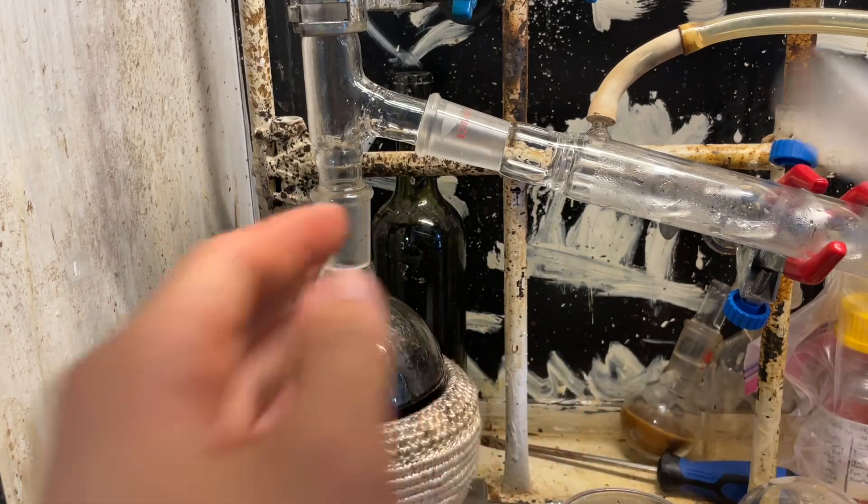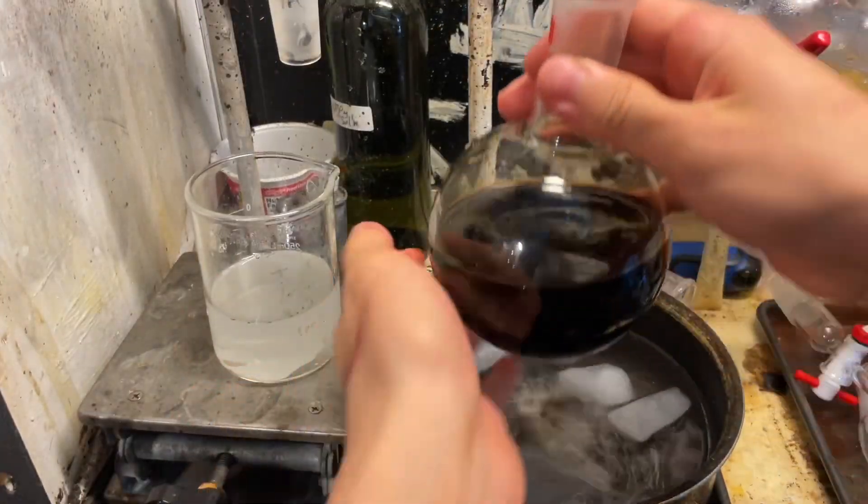We're going to let this thing cool down to room temperature. It's been cooling in the ice bath.